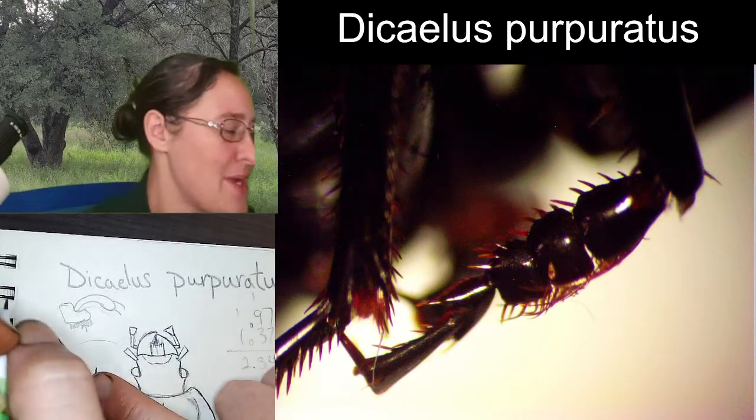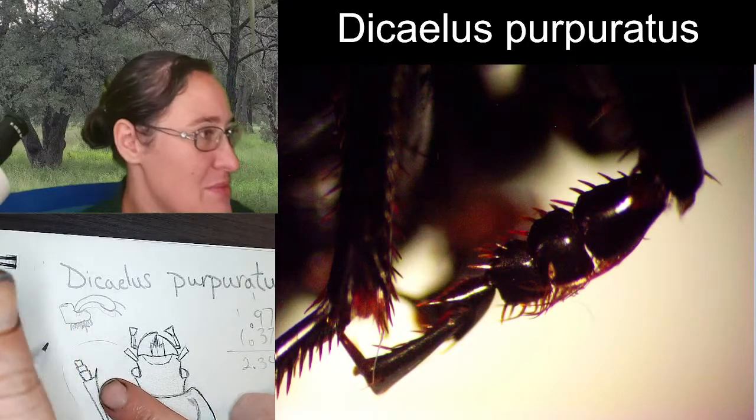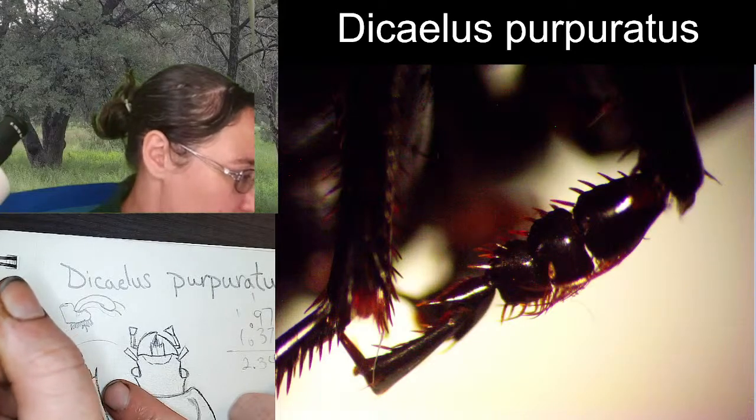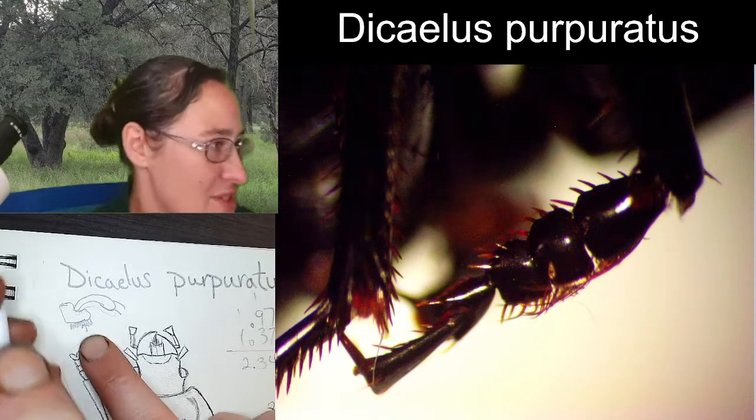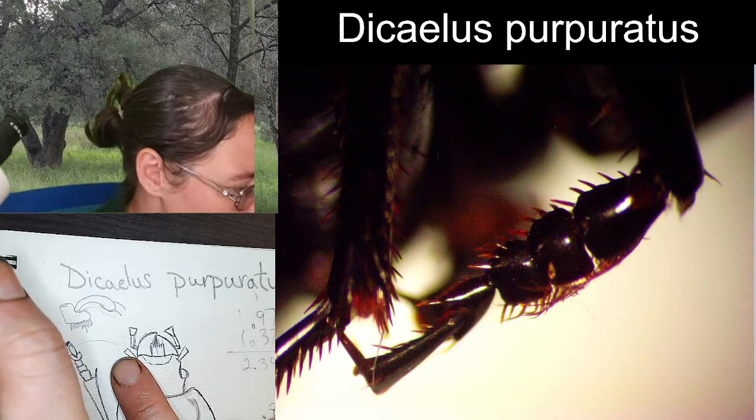From the top, it's going to look a little bit different. Sometimes we call these heart-shaped segments because they are generally bilobed, and then right there in the center is this piece here that kind of comes out. Raindrop shape, two claws.